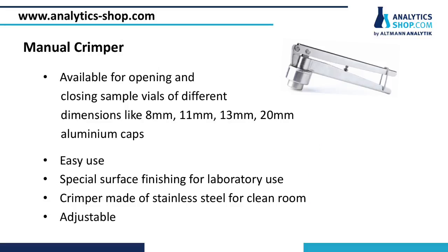Manual crimpers are available for opening and closing vials. They are made from stainless steel for applications in the clean room, or surface finished to guarantee chemical resistance. Their respective crimpers are suited for cap diameters like 8, 11, or 13 mm.